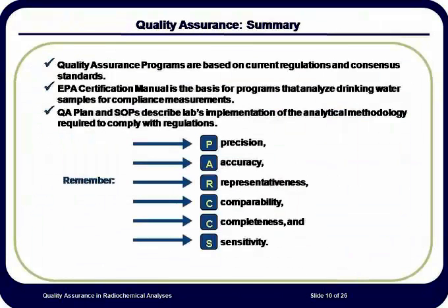The Quality Assurance Plan is a requirement for each laboratory. The regulations for this program are contained in 40 CFR and may change as a function of time. EPA publishes a certification manual that provides detailed guidance on the various areas necessary for a successful QAP.